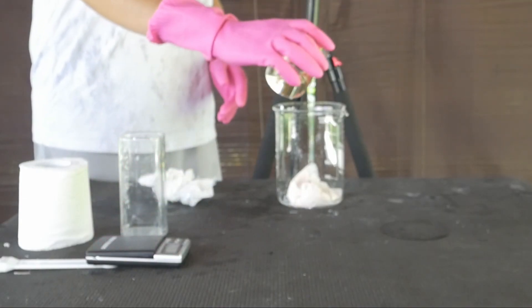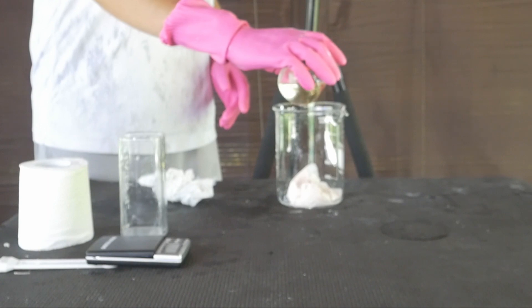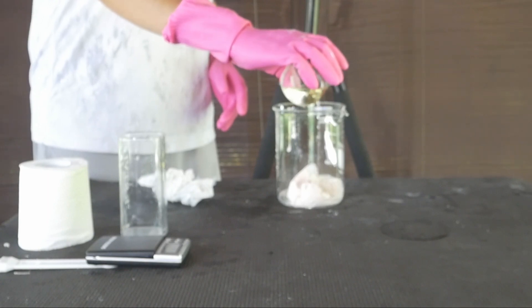Next, we take the manganese carbonate with the filter paper and everything in it, and we pour some nitric acid to dissolve it and get our manganese nitrate.